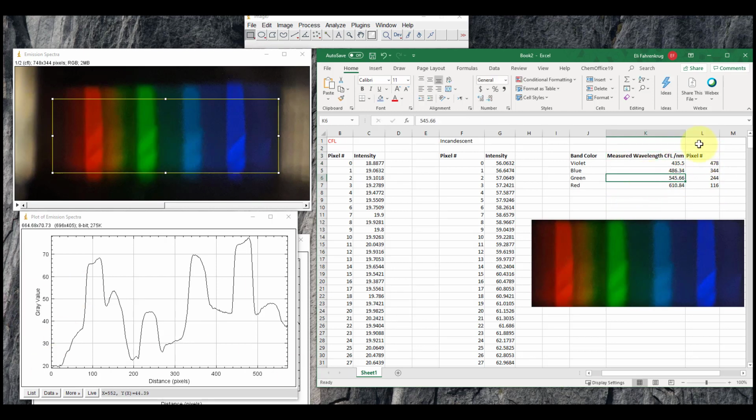as a function of the pixel number here. So what I can do is just make a simple XY plot of these two things. I establish a linear relationship between them. I'll extract an equation of the line in the form of y equals mx plus b, and then I'll be able to use that functional relationship to then convert the pixel numbers of each of my spectra and all subsequent spectra that I collect on this smartphone spectrometer. I can convert the pixel number to nanometers, which is what we want for a spectrum.